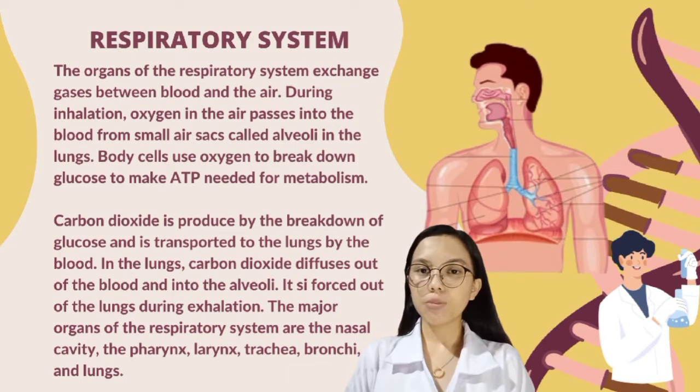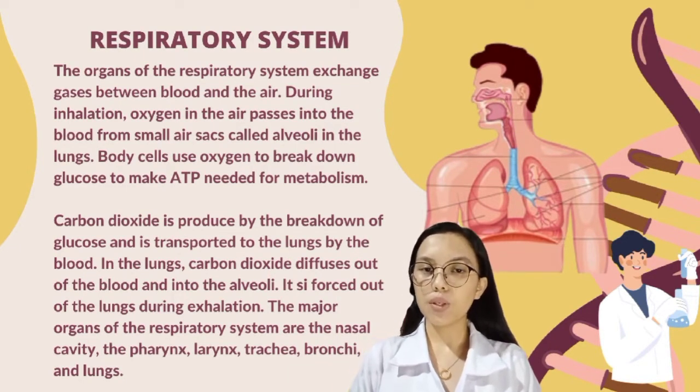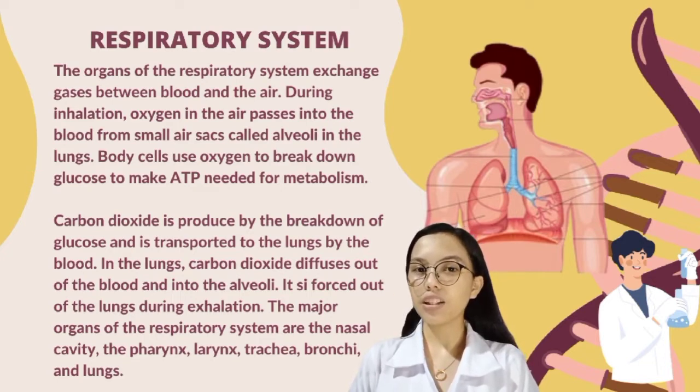Then, the respiratory system. The organs of the respiratory system exchange gases between blood and the air. During inhalation, oxygen in the air passes into the blood from small air sacs called alveoli in the lungs.